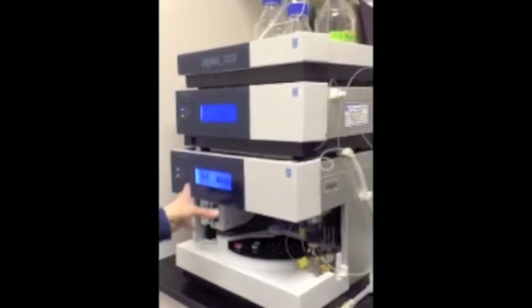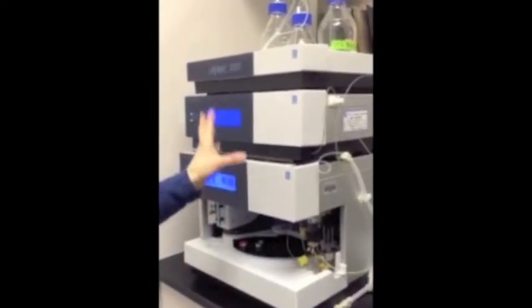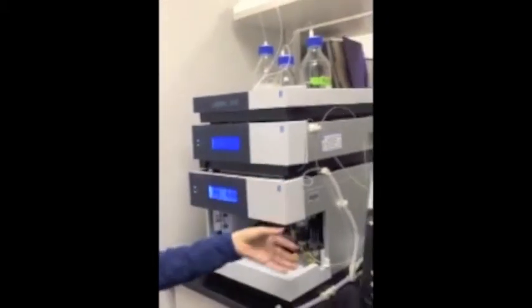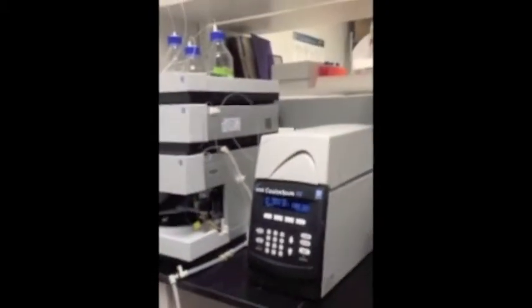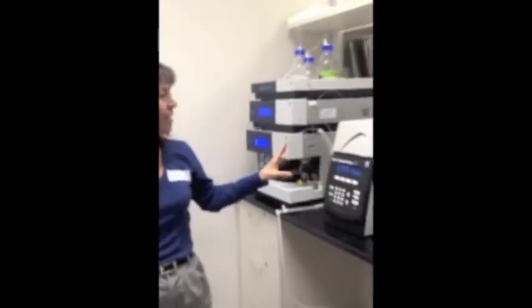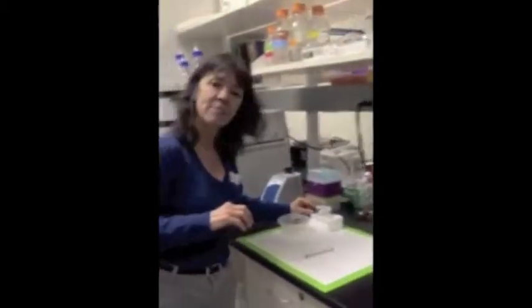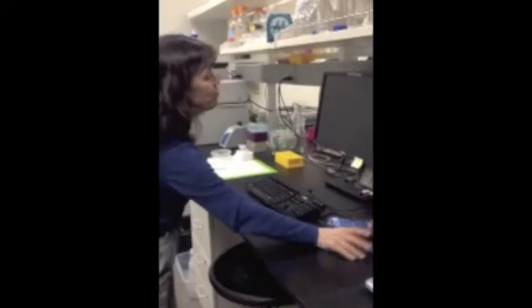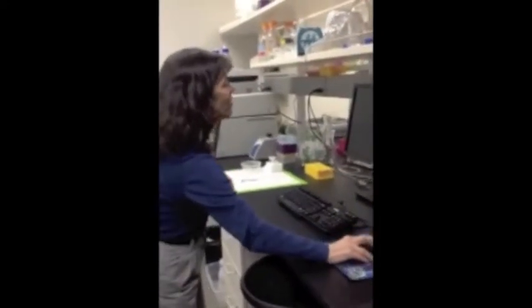And what this will do is it'll inject the sample into the HPLC, which I won't go into the nuts and bolts of because it would take too long, but we can essentially use analytical chemistry to both separate and detect our neurotransmitters of interest. And the whole thing is driven by our software.